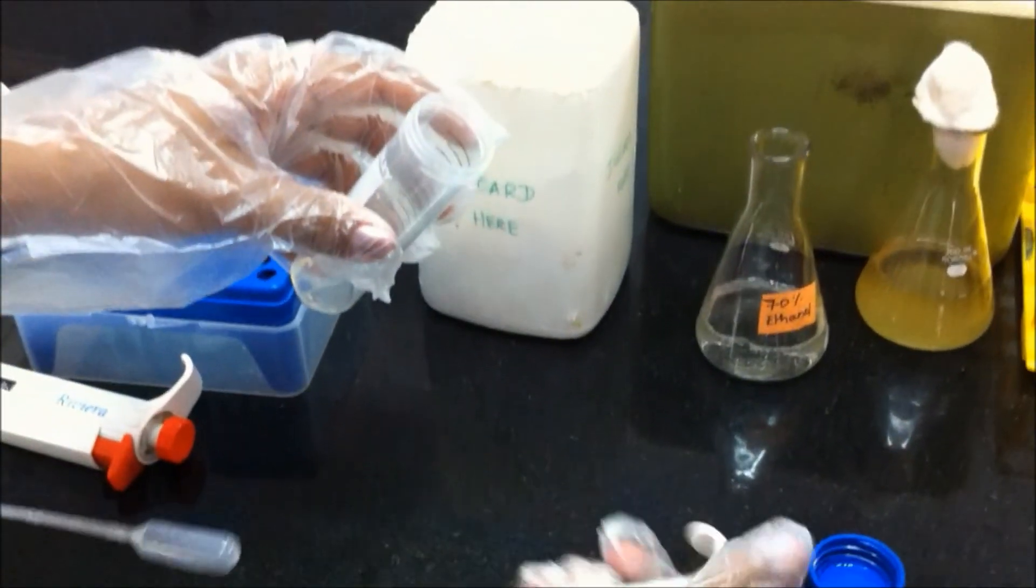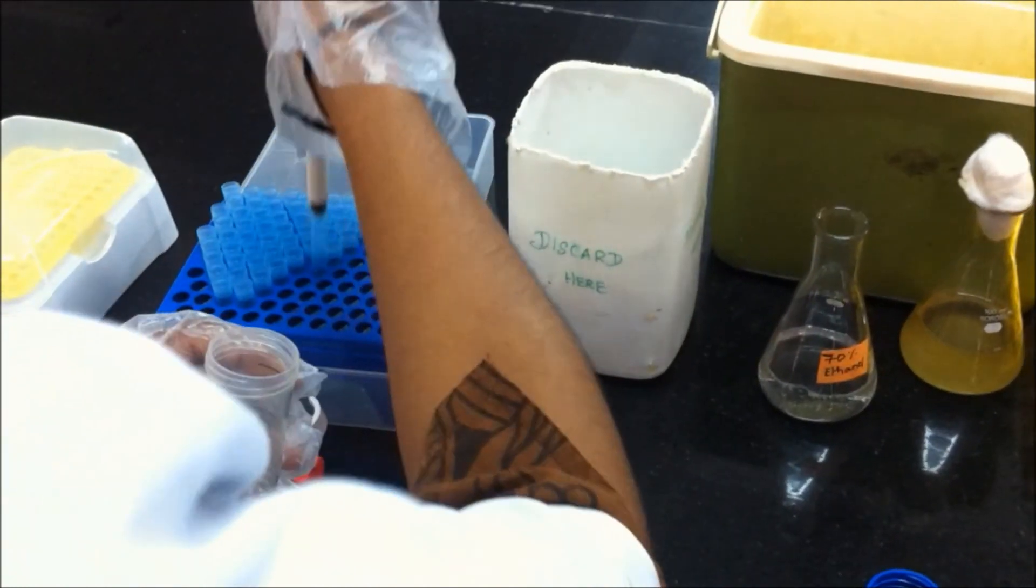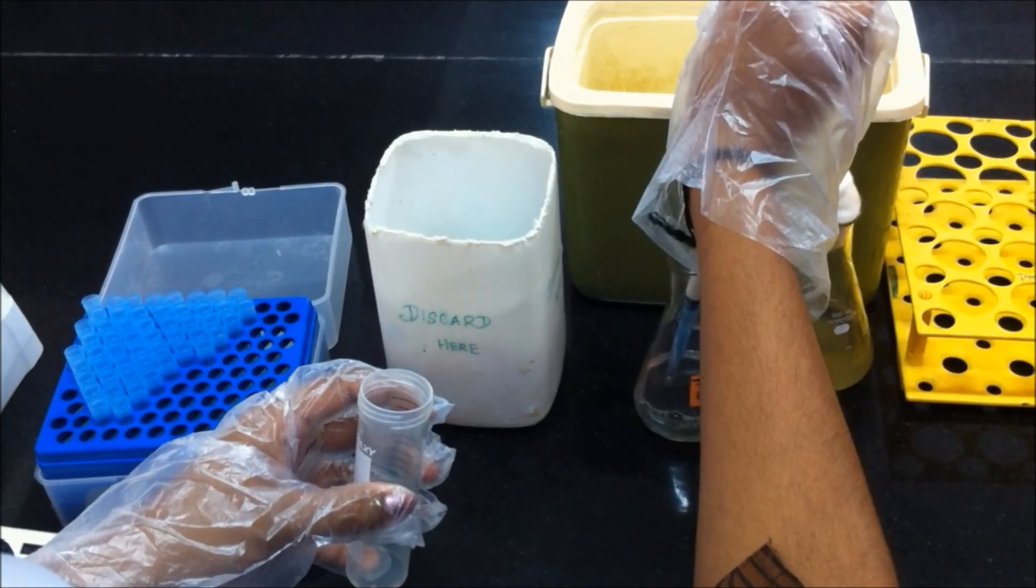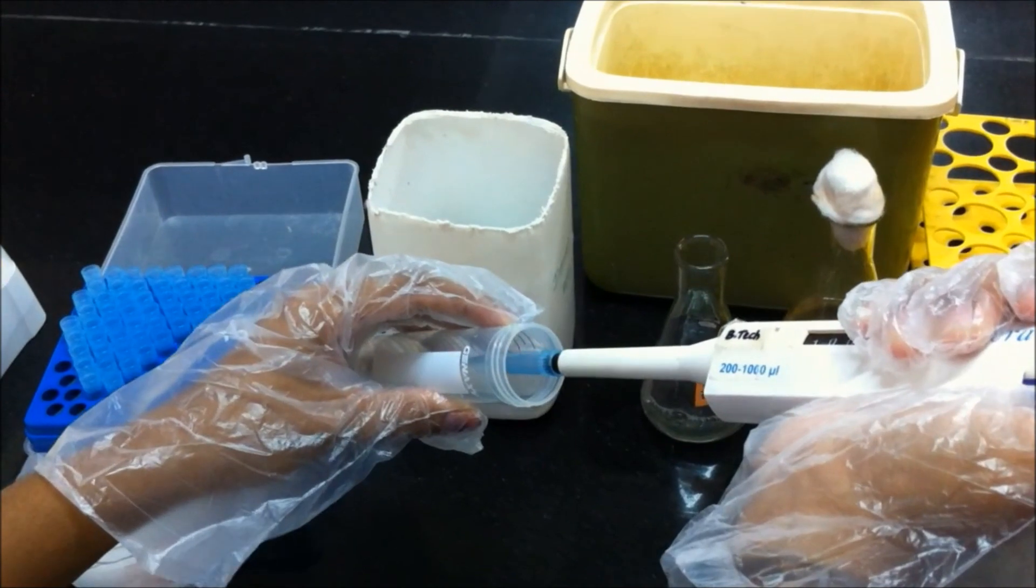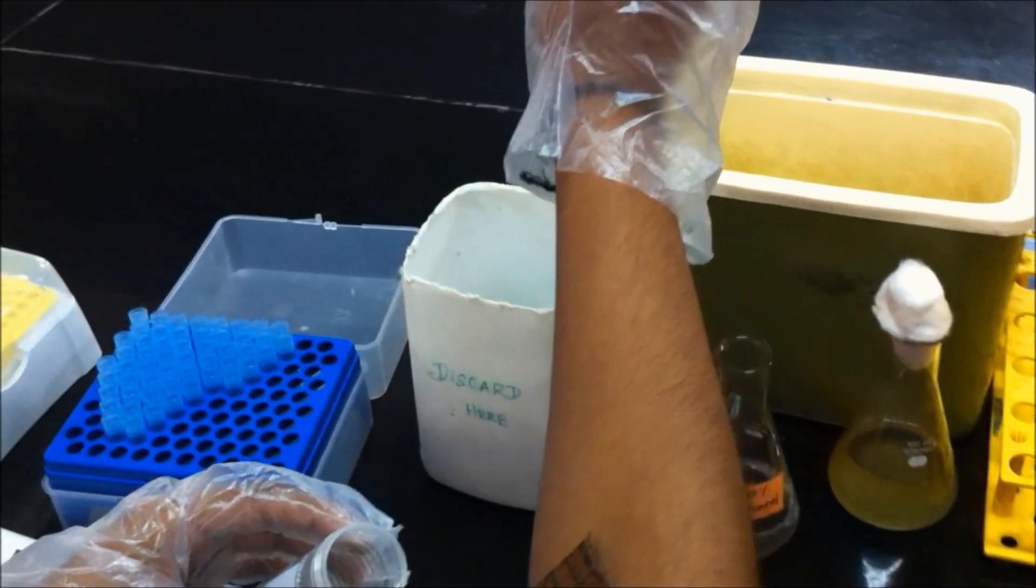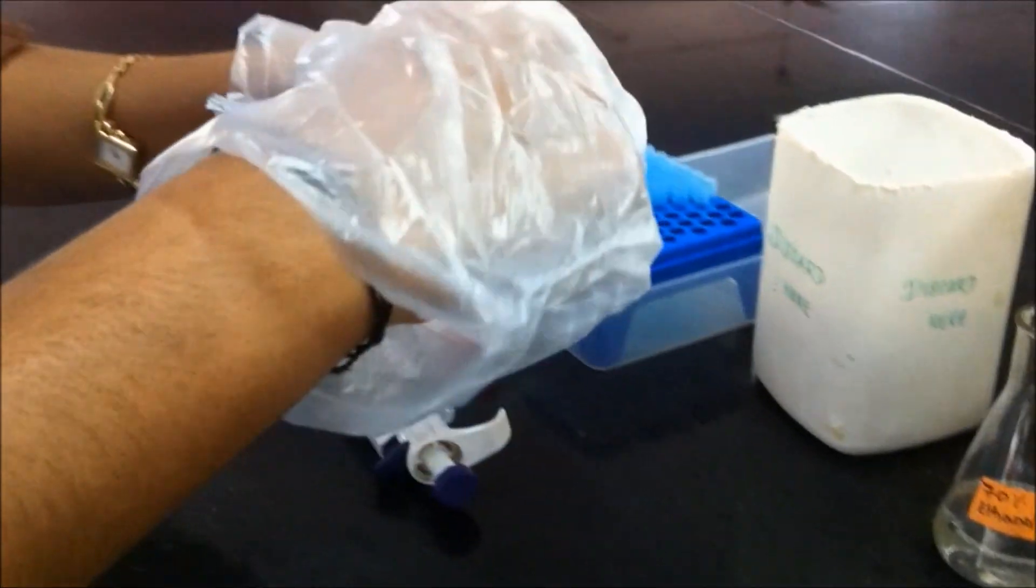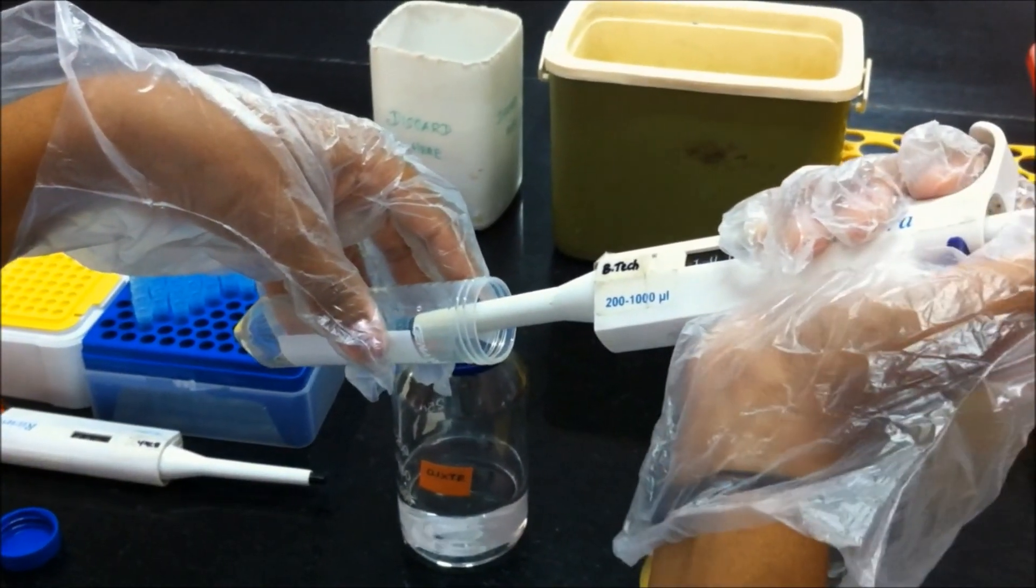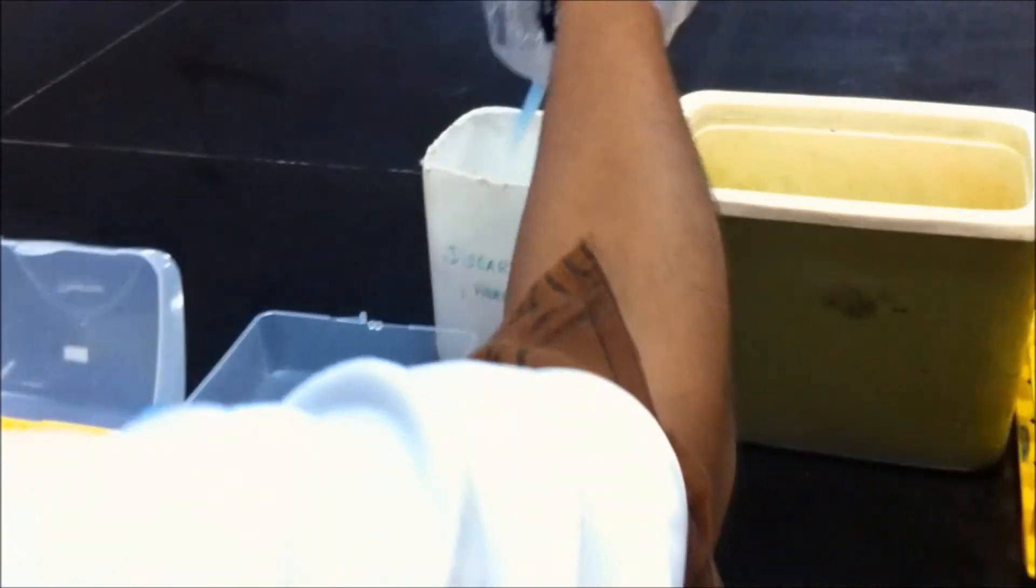Rinse the pellet with 1 ml of 70% ethanol and centrifuge at 12,000 rpm for 10 minutes. Remove the supernatant and air dry the pellet for 10 minutes.